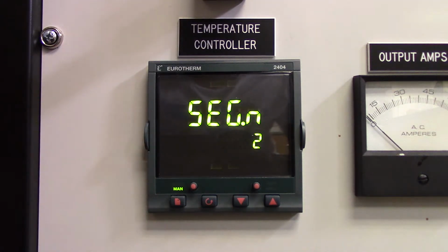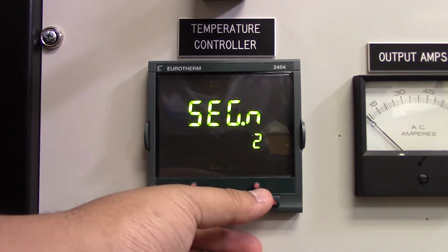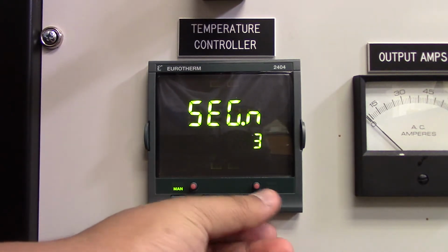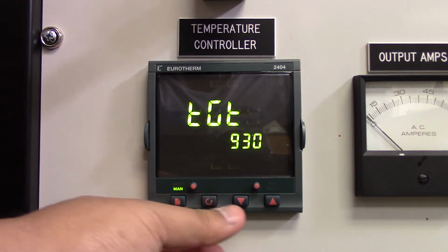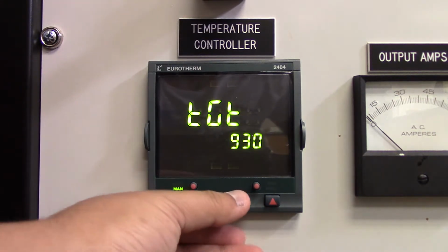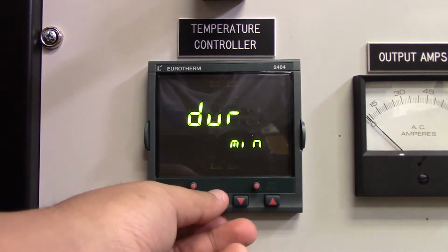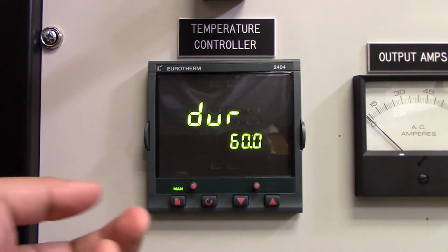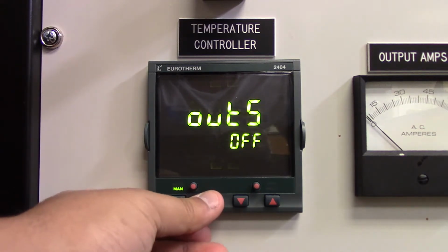There we go. And so now for the second segment, we want it to increase its temperature to 930 Celsius within an hour. So we are going to use ramp time. Oh, target temperature. I already did this before. So just change the arrow keys to whatever temperature you need it to get to. And duration in minutes. So an hour, 60 minutes. And we don't want to use any gas, so I'm just going to set all of them to off.